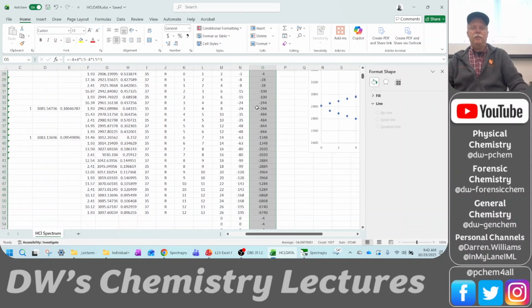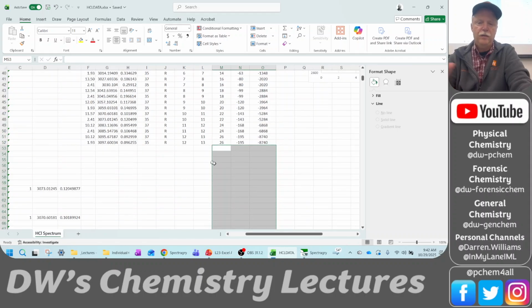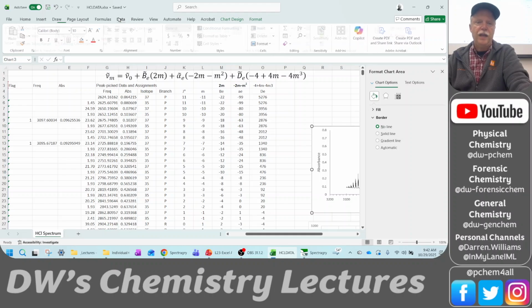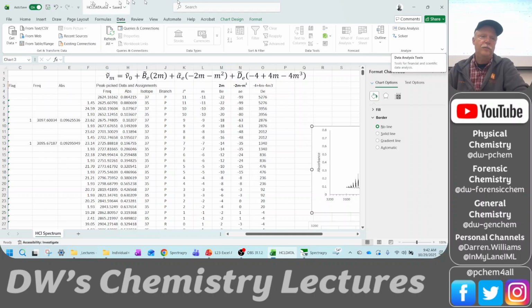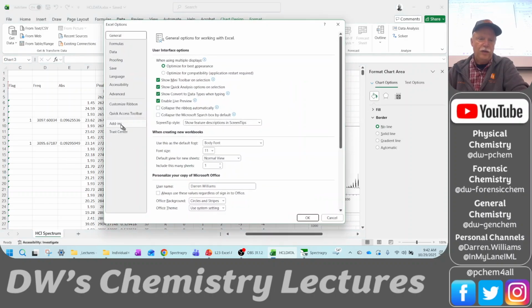Okay, so there's all of our columns. Now it still remembers these text fields that are buried in my deal, so we'll get rid of that. Okay, so we've done the assignment table. We now have our 3 regression columns, and it's time to do the linear regression. So this is on the data ribbon up here. These are called your different ribbons. And over here is the data analysis feature. If you don't have that, go through the notes. You come to File, you do Options, you do Add-ins.